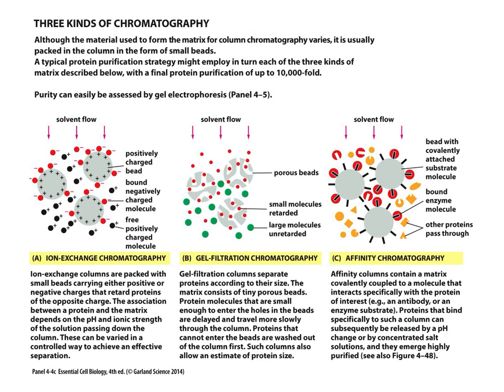So the positively charged beads would then attract any negatively charged proteins, molecules that are present in that sample that you've added. So as the material flows through the matrix, your positively charged molecules and proteins would be collected first. You then could add a solution that would maybe change the pH, and that would allow for these negatively charged molecules to be released by those beads, and then they would move into it. So you would switch to your test tubes before you added your solution.